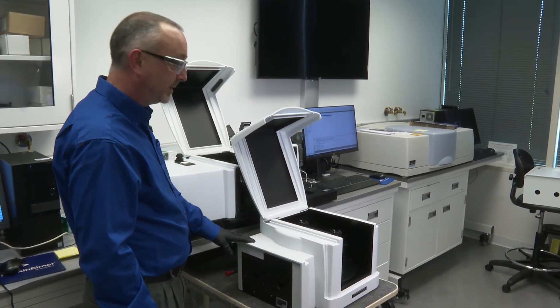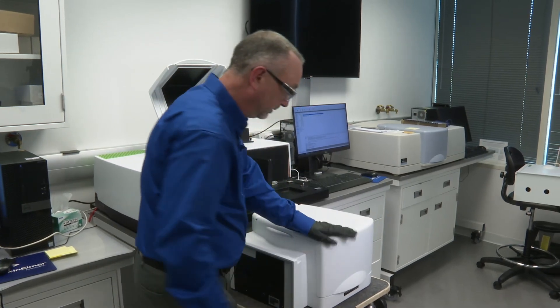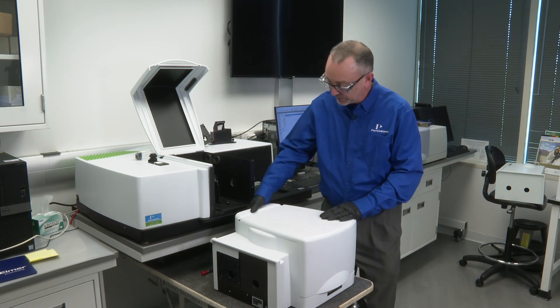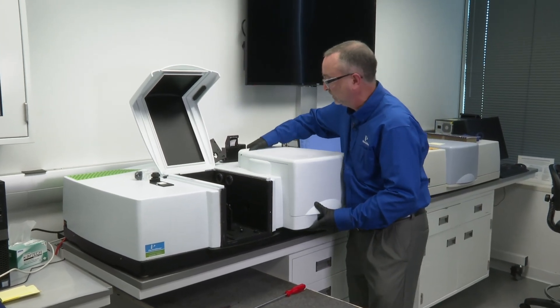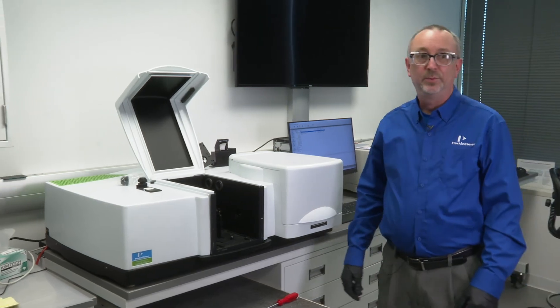Once the reference and sample detectors have been replaced, close the lid, put your hand in the handhold here, and pivot slightly. The TAMS is now ready to be used.